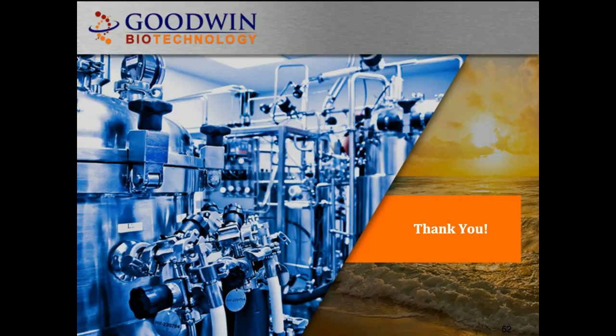That's why it's critical, if you are doing chemical sterilization, to make sure it's a validated process and that there's repeated validation being done to make sure that the residuals are eliminated. Now, I'll be honest, a lot of our business is moving more away from chemical sterilization. We can still do that, but due to the safety concerns, I'm seeing an increase in autoclave and irradiation sterilization.